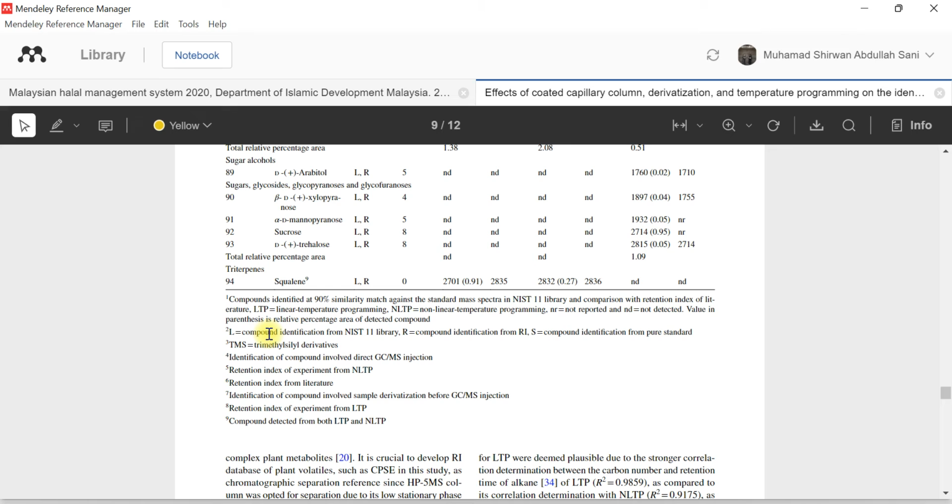I don't focus on unknown. Okay, so that is my approach lah. Kalau you dekat IBS, mungkin perlu buat that RI, if you are looking for new compound, yes. Tapi for me, I don't want to focus on the unknown one. I want to focus the known lah. So that's why I don't choose that way.